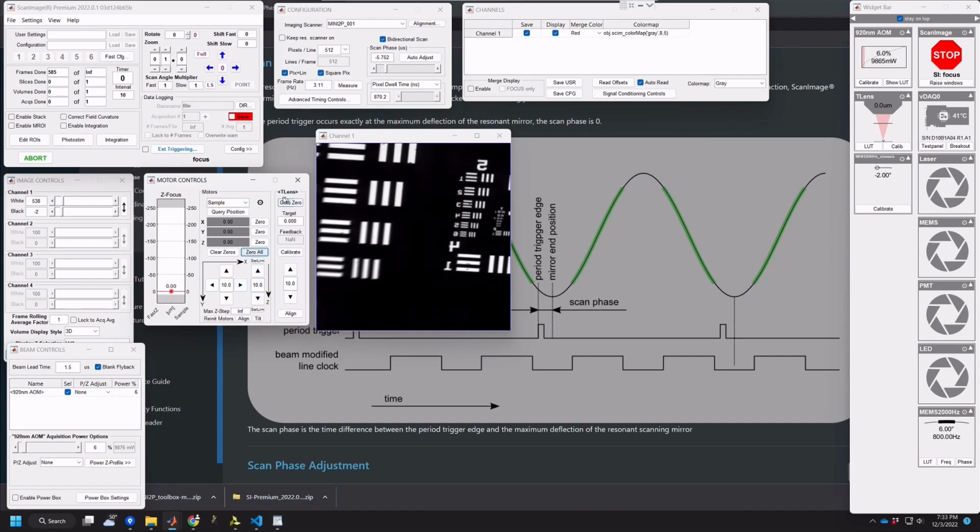If you want to move your FastZ location, you can change the Z using your microT lens like this. And you can see your ranges from +10 to minus 250.